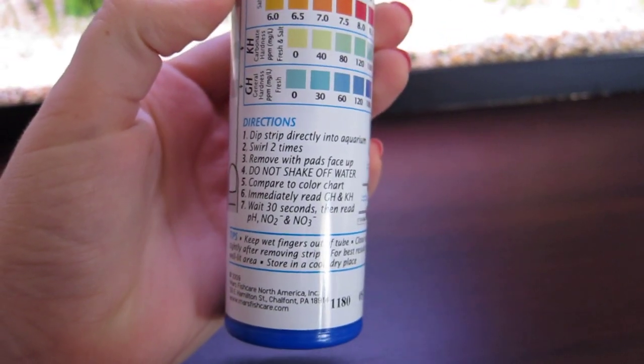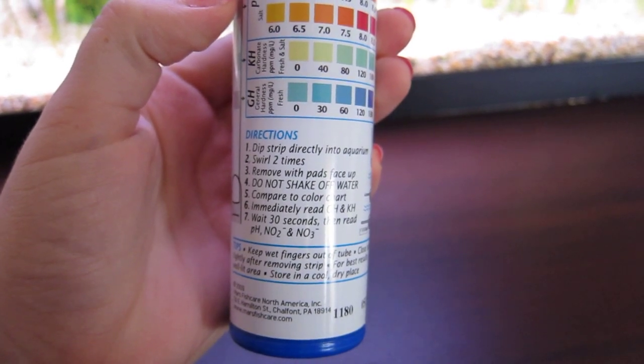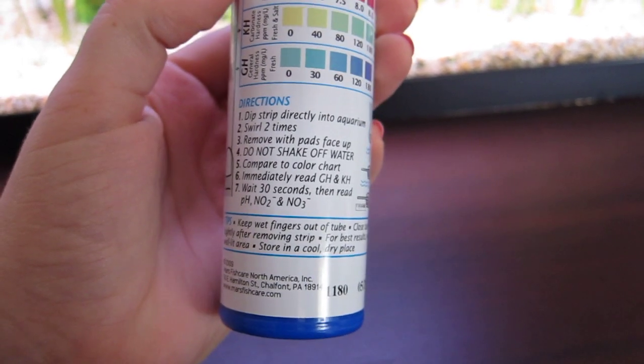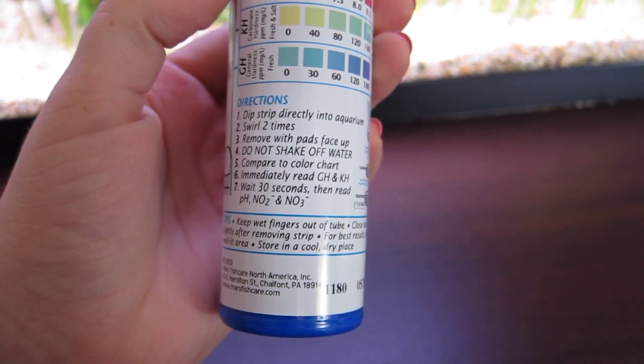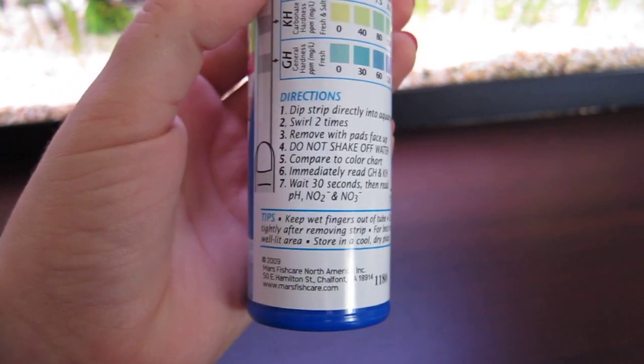The directions say to dip the strips directly into the aquarium, swirl around two times, remove with pads facing up, do not shake off the water, and compare to the color chart. You're meant to read the GH and KH immediately and wait 30 seconds to read the pH, the nitrite, and the nitrate levels.